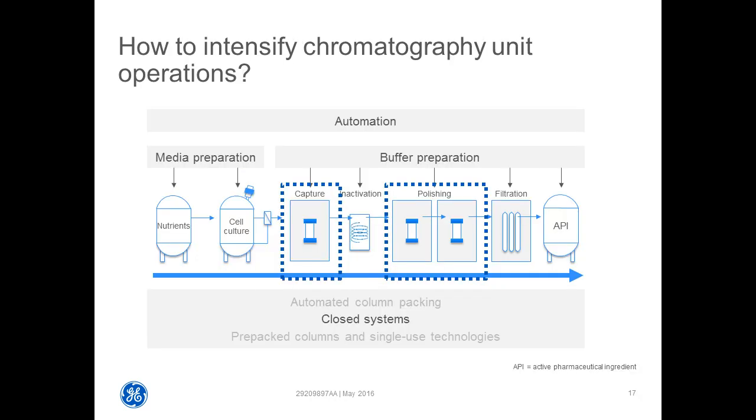The next thing that we're going to talk about is, column packing is one critical aspect of chromatography unit operations, but it's not the only aspect. Right?